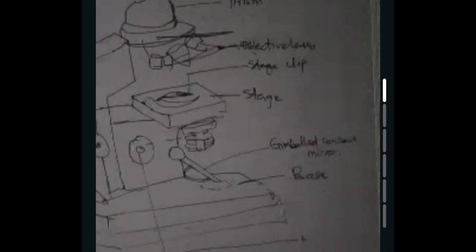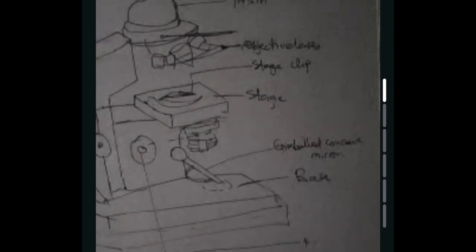Please take a good look at what I'm drawing now. Passing through this place. What is this? This one. So it is number 4. What could it be, everyone? Focus control. Number 4. What do you call it? Focus control. Thank you.